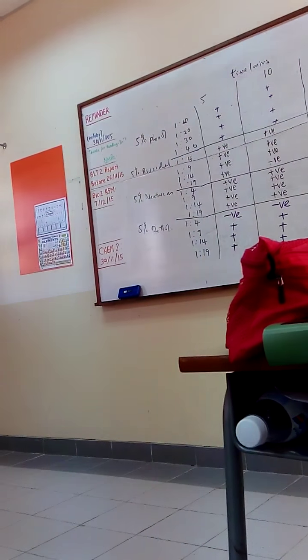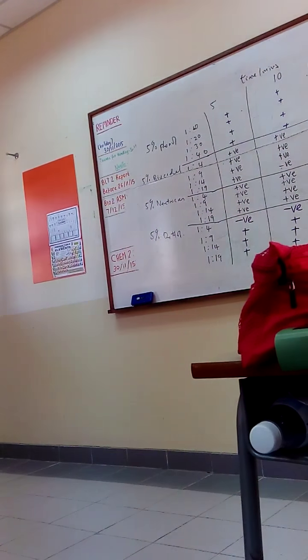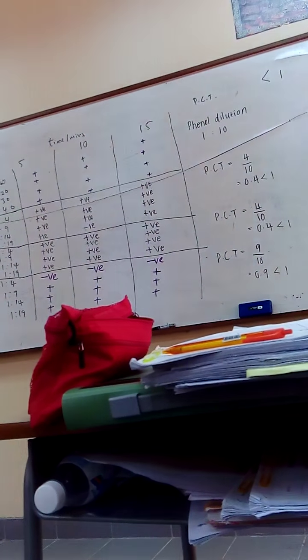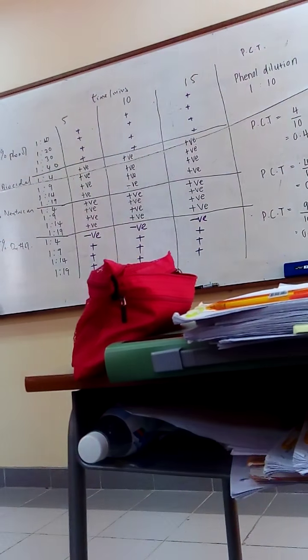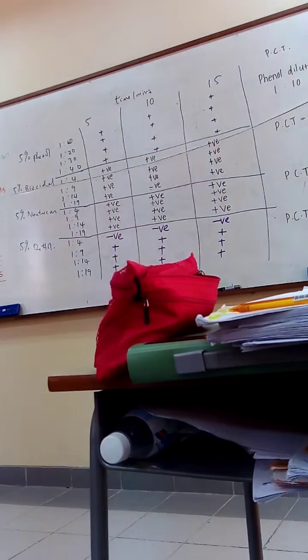Why does the ratio have to be made the same? Because it is one standard ratio, for the standard one. It's probably that the 5% should be increased to higher. So you can recommend that we should use a much higher percentage concentration of the phenol and the tested disinfectant to get better results.